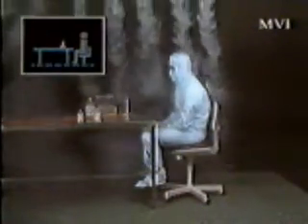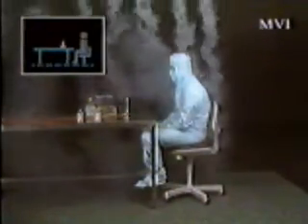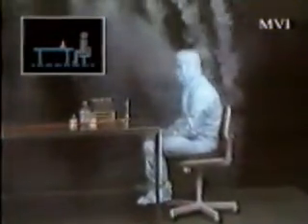The second demonstration, using a Bunsen burner, needs no comment. The thermal effect is significant and is unlikely to reduce. Work requiring this type of flame or heat should be undertaken with great care and detailed placing of the adjacent workstations. Contamination by entrainment and redeposition will be very heavy.